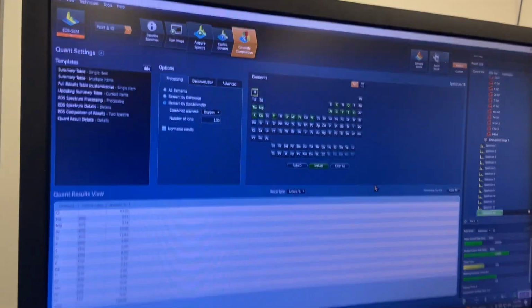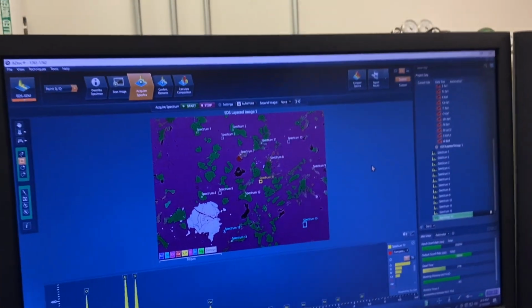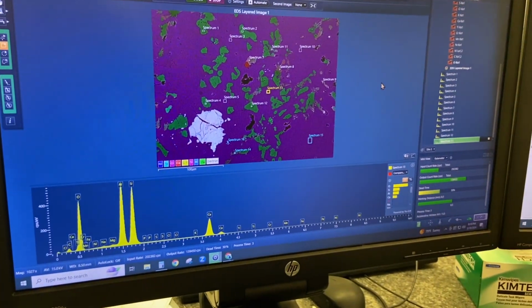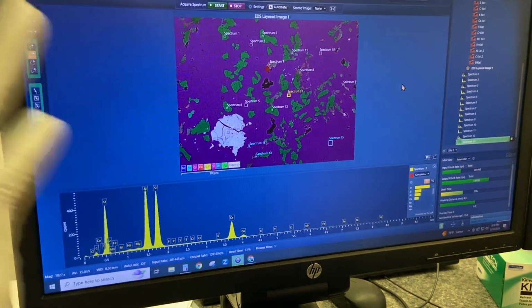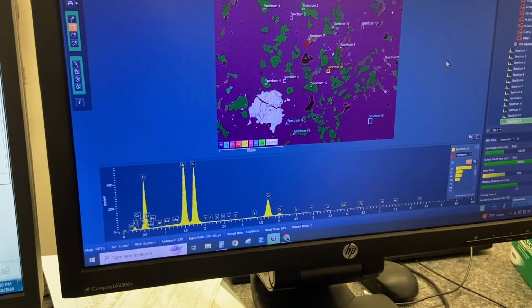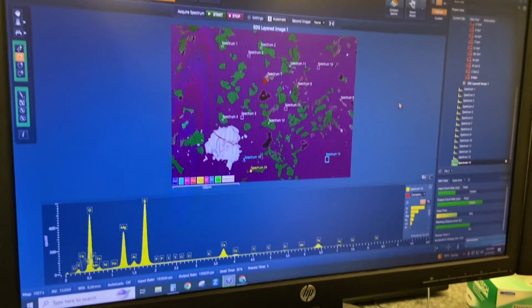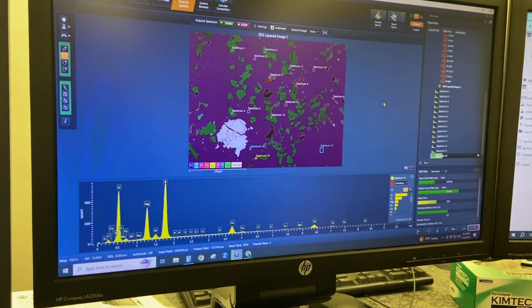So, yeah, this is how classification works. We just get a bunch of points. We get mineral compositions, and we put them into the Meteoritical Bulletin database. That's really all there is to it. We take lots of nice and pretty images to find out what the textures of our classes are, but really we're just seeking these mineral compositions. That's kind of the end goal here. And once we have that and we have everything established, we can do a write-up.